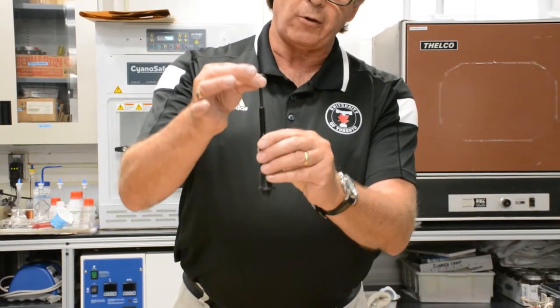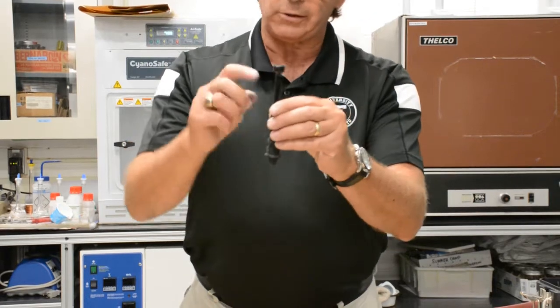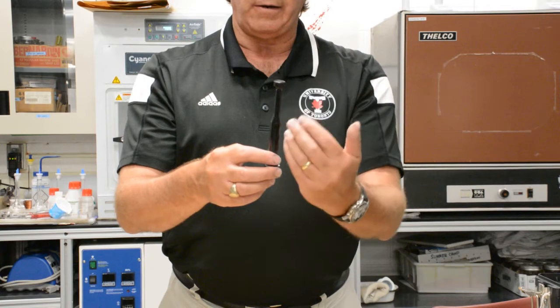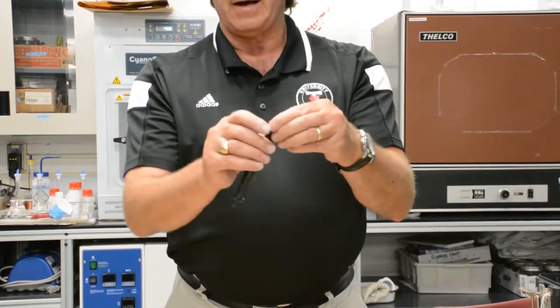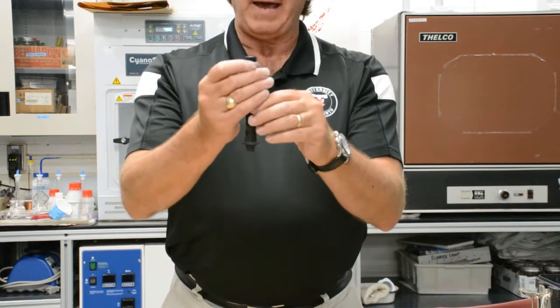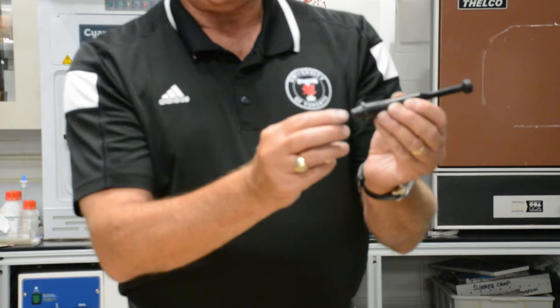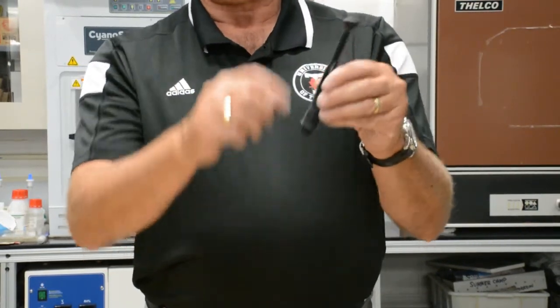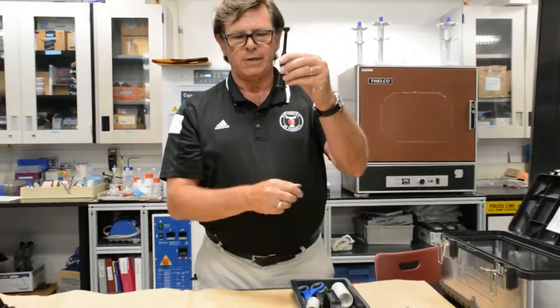And this one here is spring-loaded. If I let it go, it wants to retract back into its housing, the outer shell. So there's the outer shell, an inner shaft or probe in there as well. The inner shaft actually has a magnet attached to the bottom of it. So this has a metal surface on the outer probe. The magnet is on the inner shaft, which in this case is now within that metal tip.